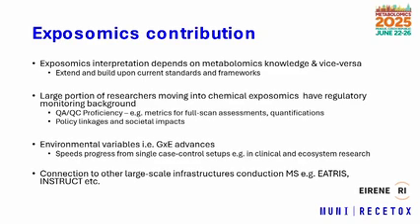There's also a large proportion of researchers moving into chemical exposomics in a broad screening manner, so now moving from more quantitative, targeted, selective ion acquisitions to full scan acquisitions. They're moving in from a very heavy regulatory background, so there's a lot of QA/QC proficiency, metrics for assessment, and quantification and qualification of how you would assess full scan data, including how you would interpret true positive and false positive rates, etc. This could be something contributed into metabolomics, because that is somewhat lacking.